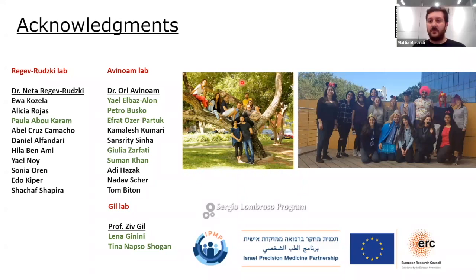I did some cryo-EM imaging of EVs at different pHs, but I haven't looked at aggregation, because we were looking at another thing. We were looking at the protein corona, hoping to find what you see in viruses. Definitely for liposomes, yes, you see somewhat shallow aggregates, not as tight junctions, but still. But in terms of colloidal stability, no, I didn't notice drastic differences.